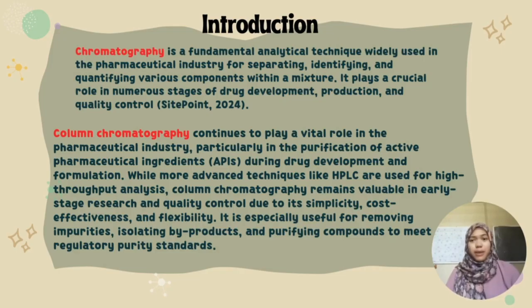So, it does play an important role in the pharmaceutical industry, particularly in the purification of active pharmaceutical ingredients, which is APIs, during drug development and also formulation.